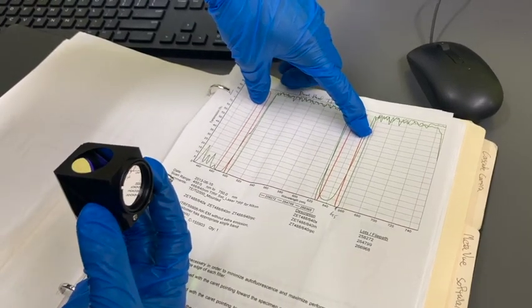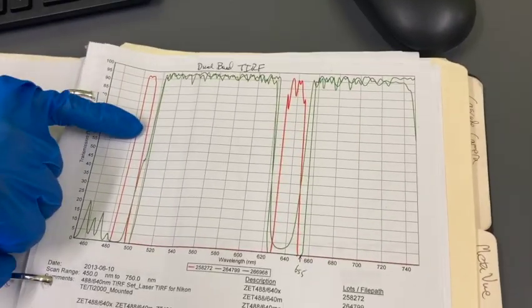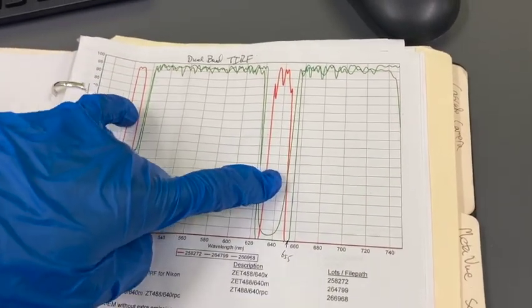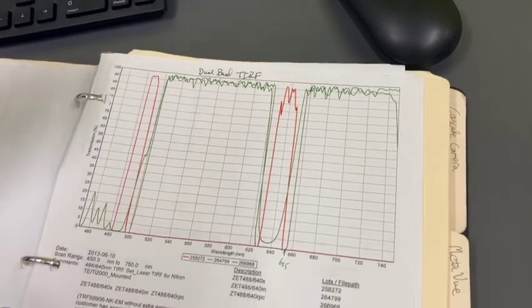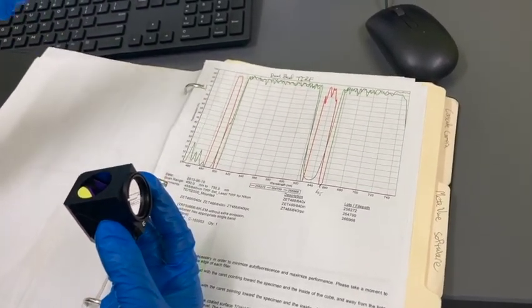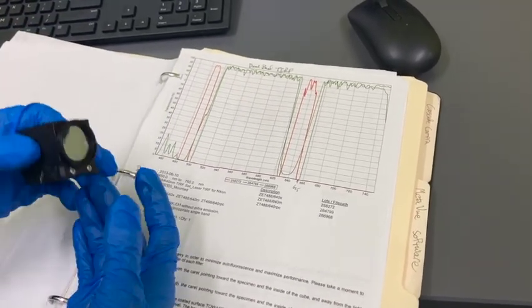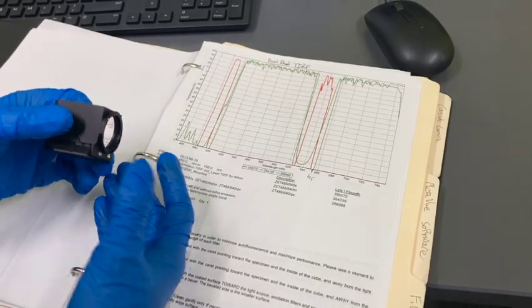The red will pass our blue laser and our red laser. So with 2-light, you can use the blue laser and the red laser to excite whatever dyes you are using. Like we use blue for GFP and for most of the Q-dots.